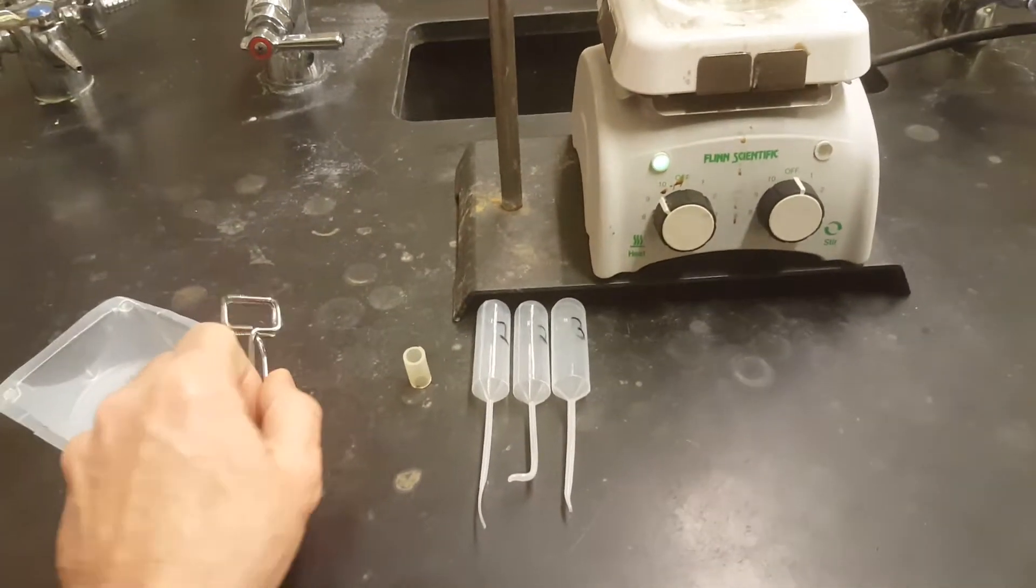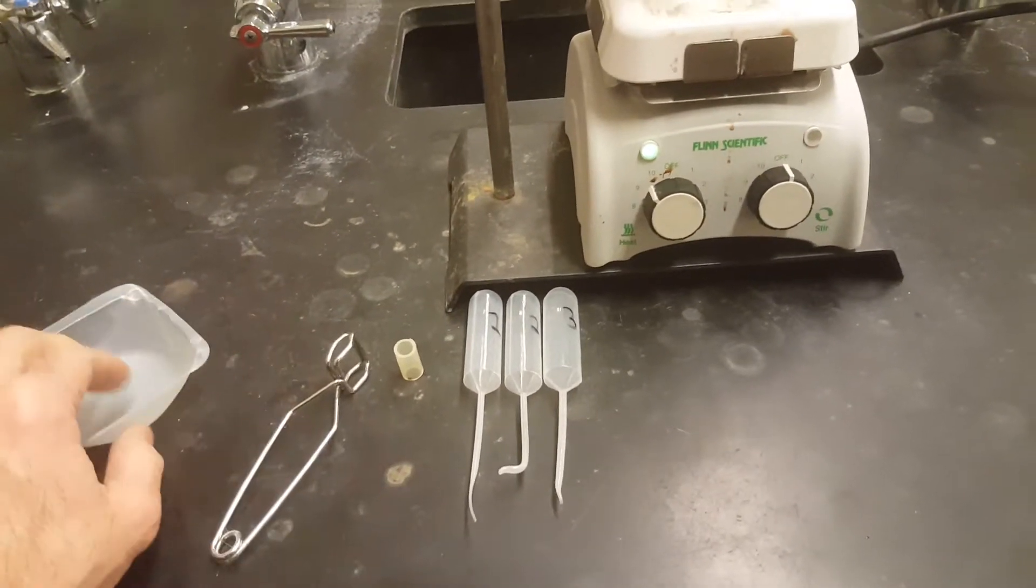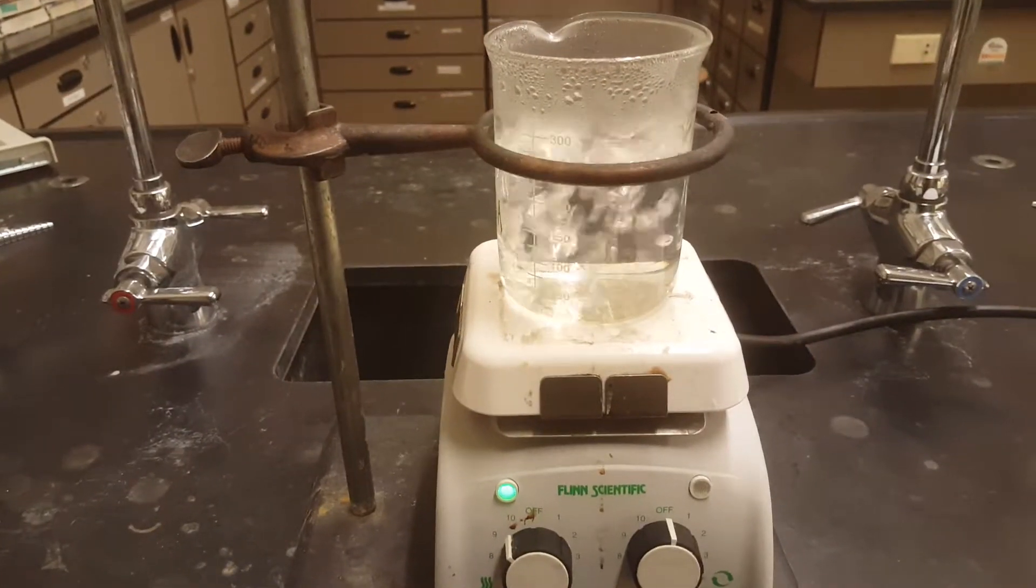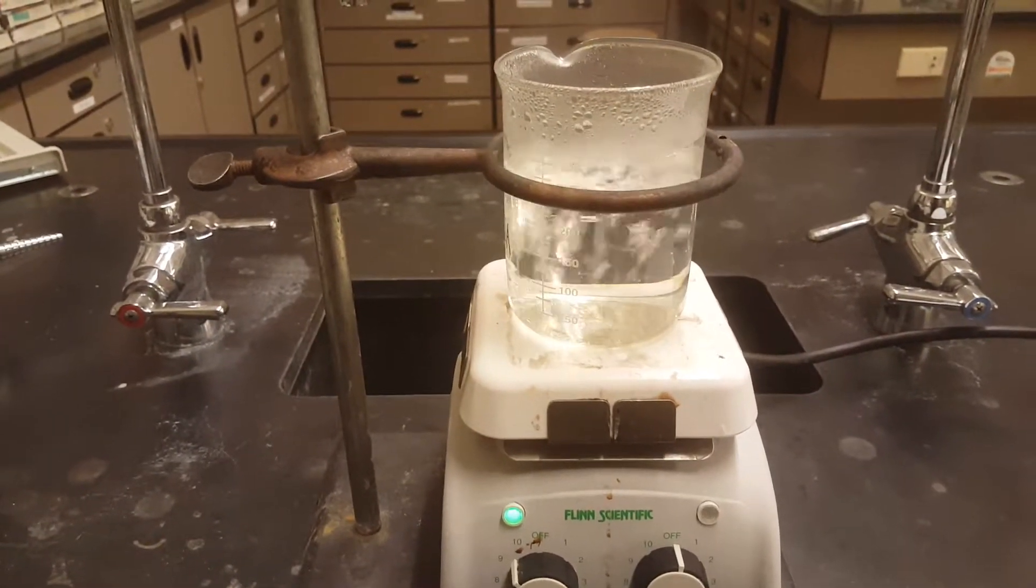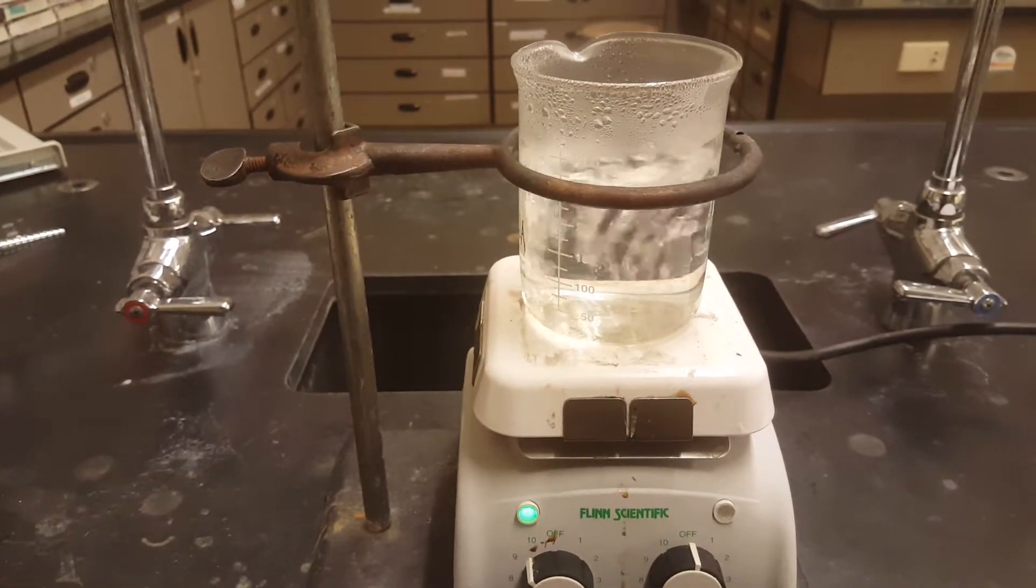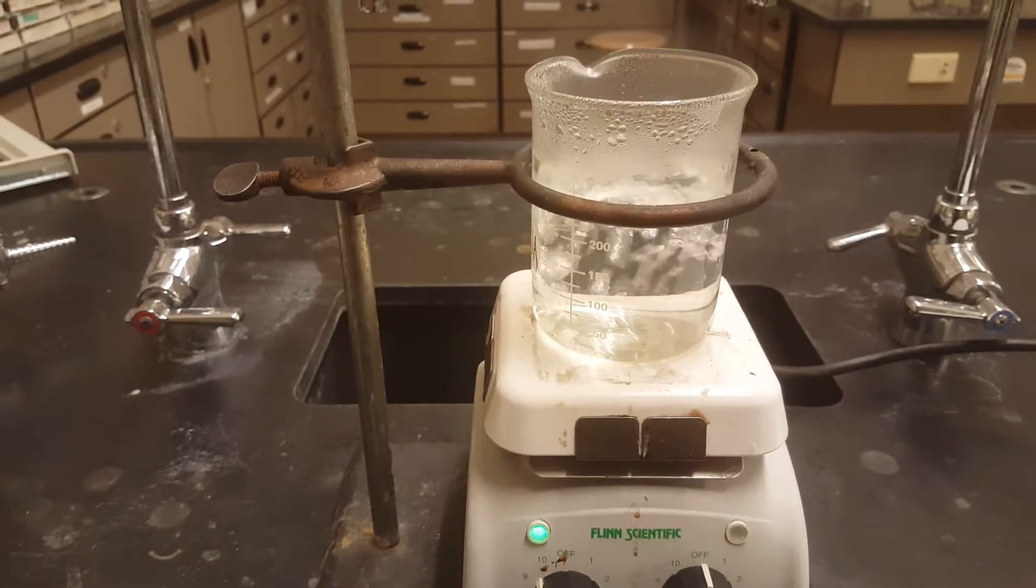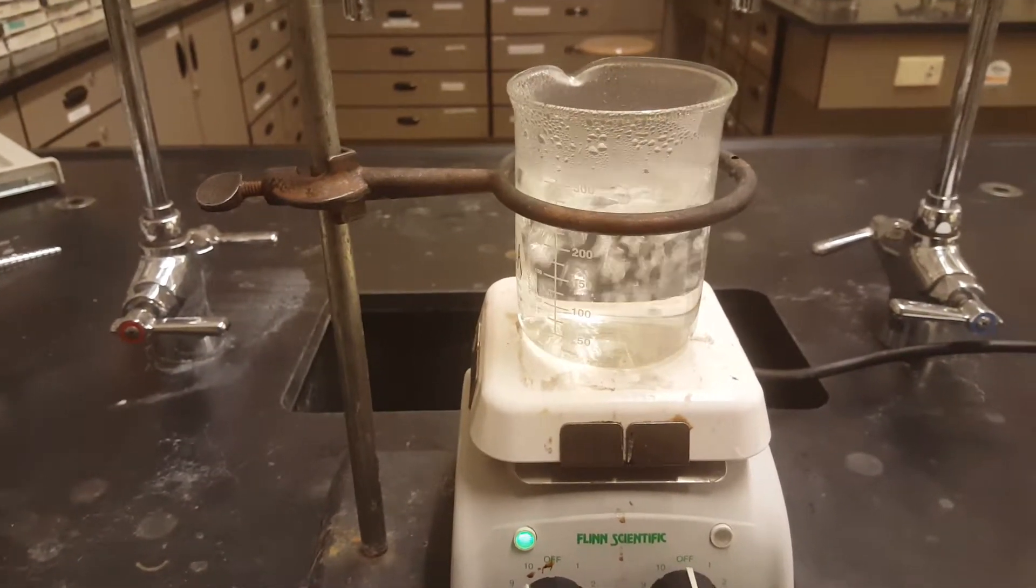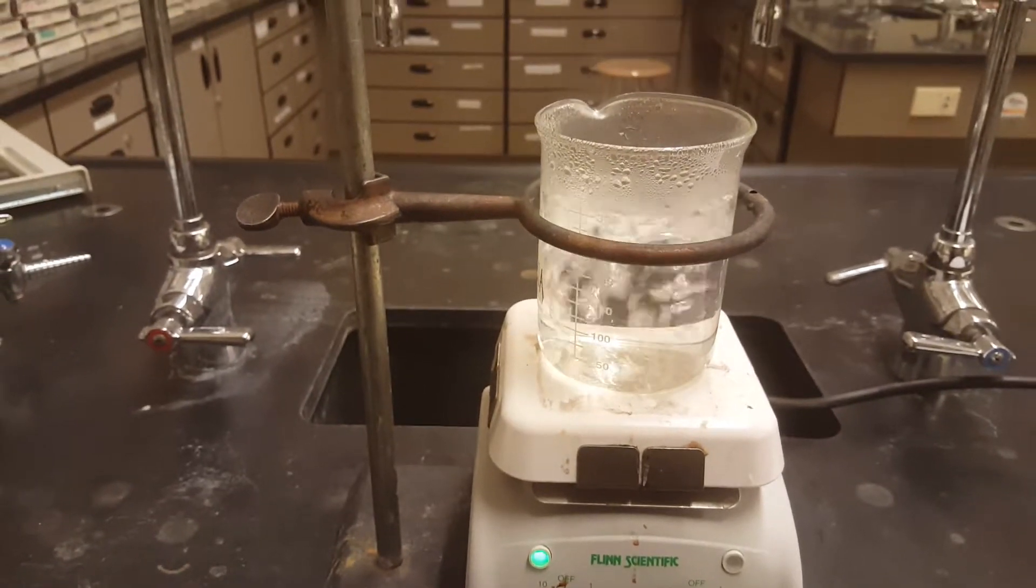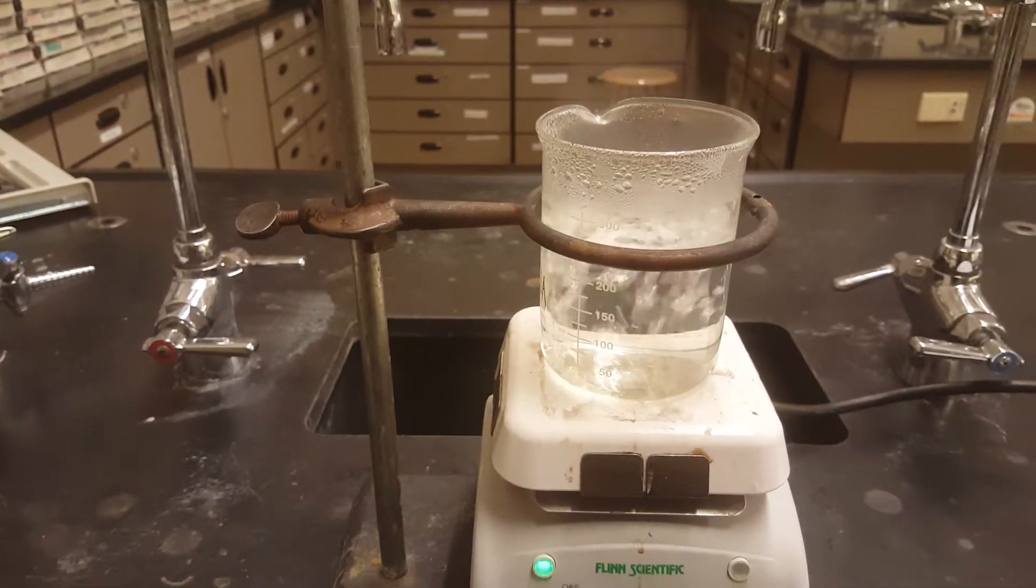Make sure you have a test tube clamp, a weigh boat, and about 300 milliliters of water in your 400 milliliter beaker to start. And make sure it's deionized. We're gonna boil water in here all day and tap water boiling away will leave behind lime scale. Make sure it's DI water or distilled water.